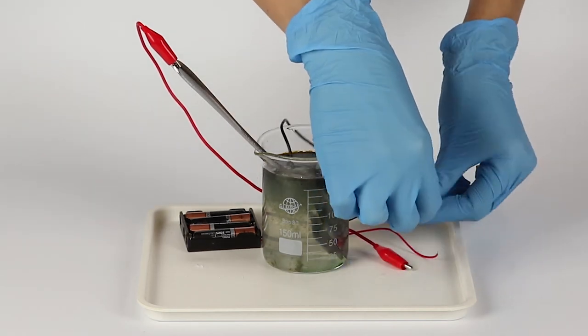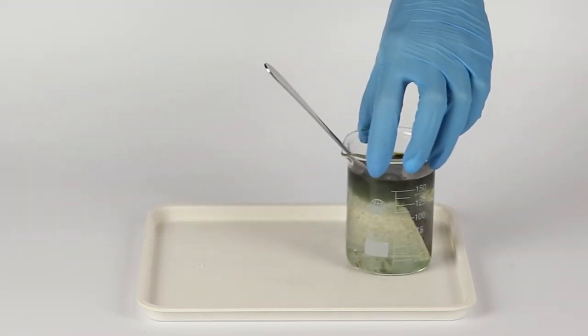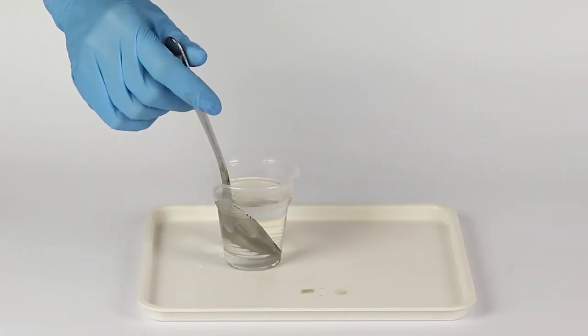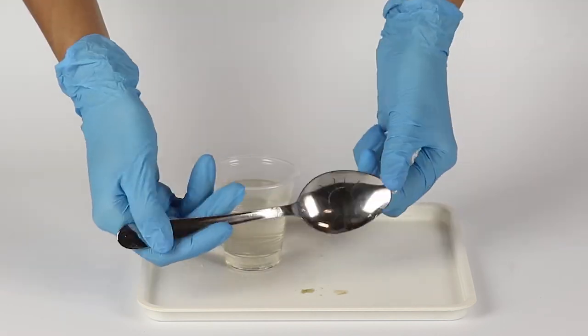Now disconnect the wires and prepare some hot water. Take the spoon out of the reaction mixture and immerse it in the hot water. Then remove the paraffin from the spoon using a napkin, and the image is revealed.